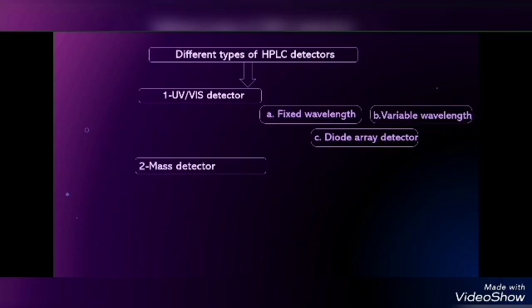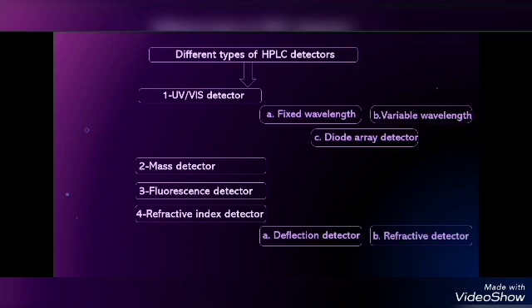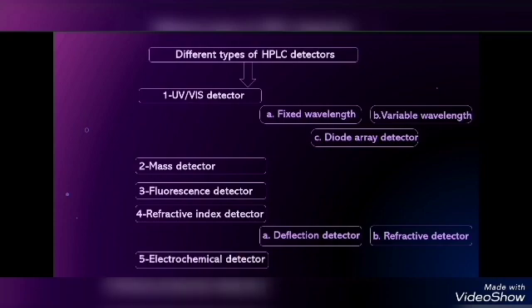Mass detector. 3. Fluorescence detector. 4. Refractive index detector: A. Deflection detector, B. Refractive detector. 5. Electrochemical detector.